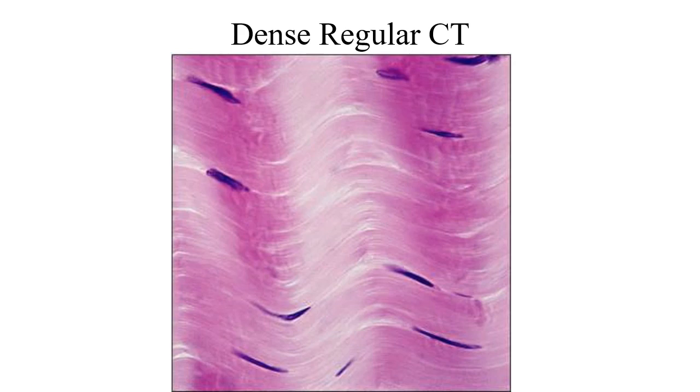And so if we were to pull end to end on the spaghetti, it's not really going to break when we pull end to end. Or even if we were to push down from top towards bottom, it's going to be more difficult for it to break in that sense. Versus its counterpart in dense irregular, it's not as strong, but it can be strong in multiple directions. Dense regular is more strong just in a linear sense.